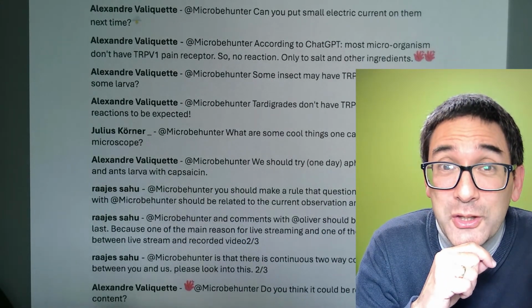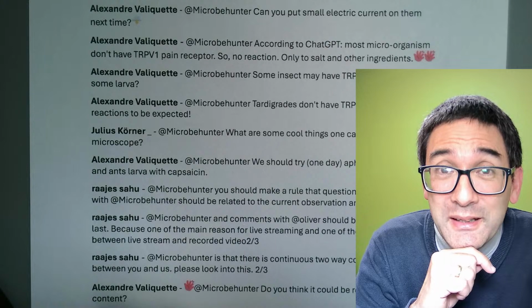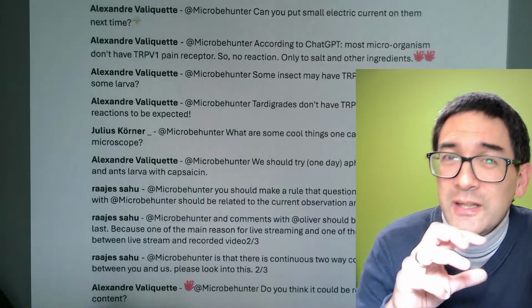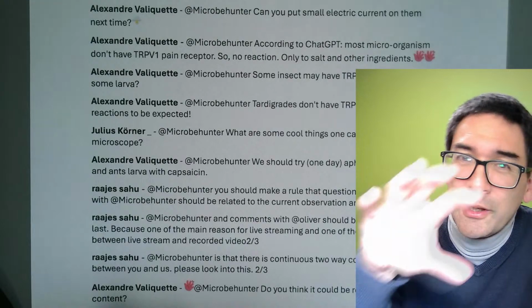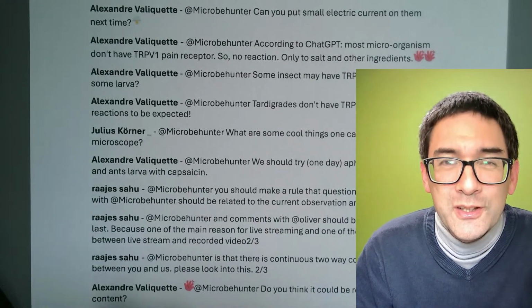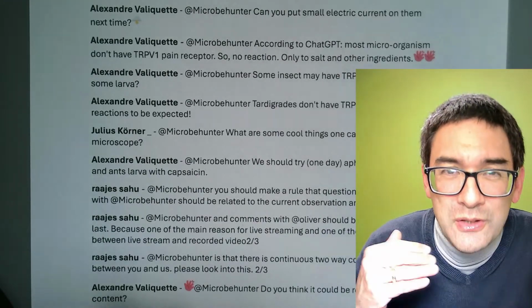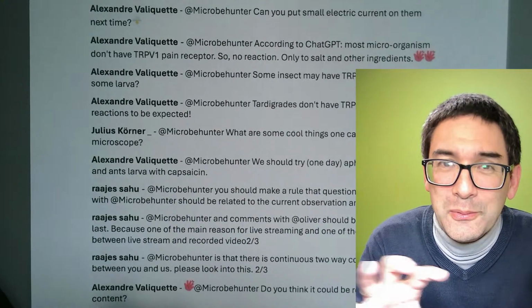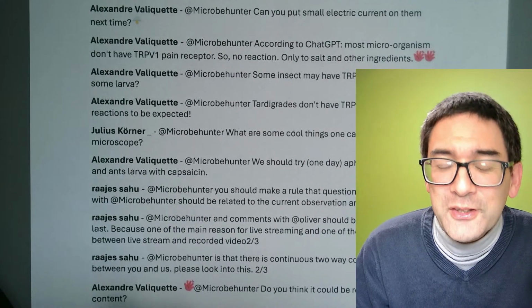Indeed, I already mentioned it before, white blood cells in time lapse. I think that was really fascinating, because you can actually see how they're moving around, how they're following other bacteria. You have to be really patient, and you need a camera because you need to film this for a long time, and then you have to speed it up to be able to see the movement properly. But I found that quite fascinating.